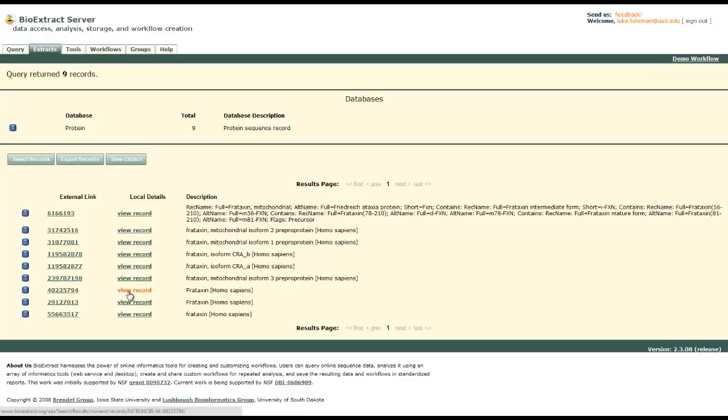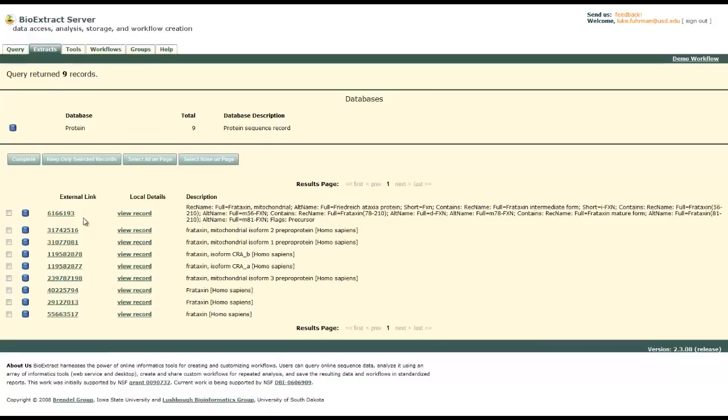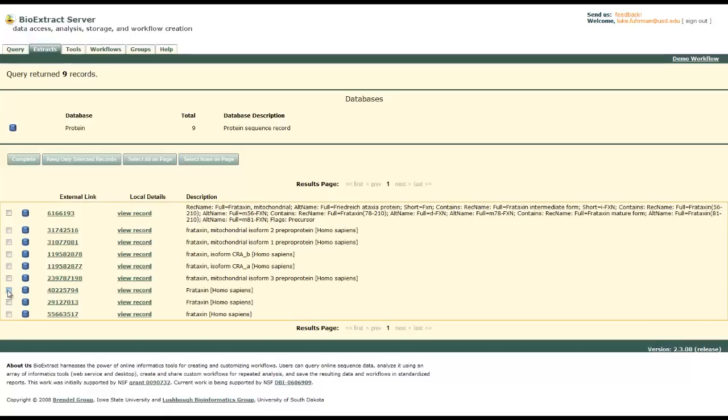Let's go to select and we will check the box for the ones that we would like to keep. We will click keep only selected records to narrow it down a little bit more.